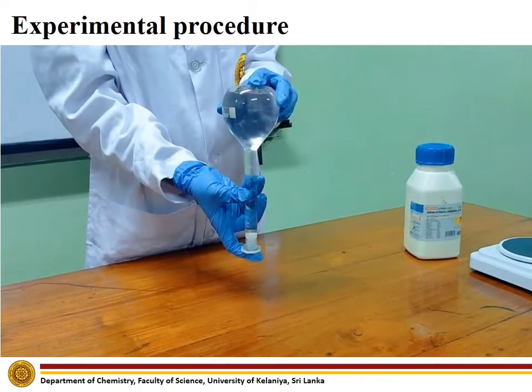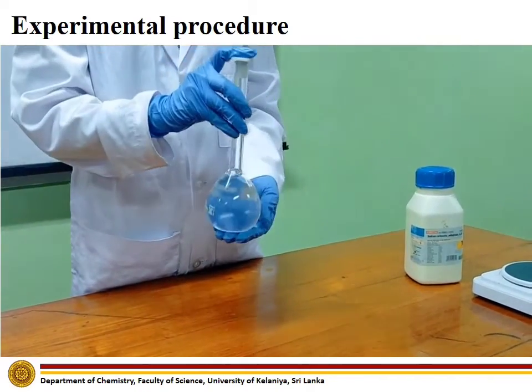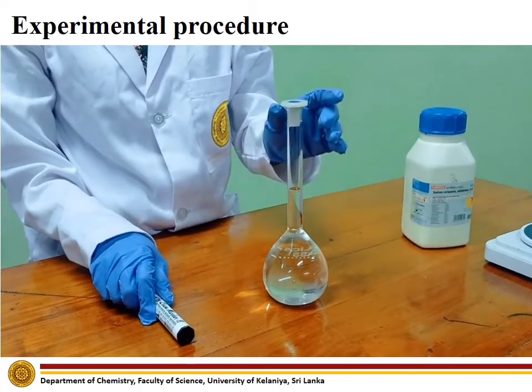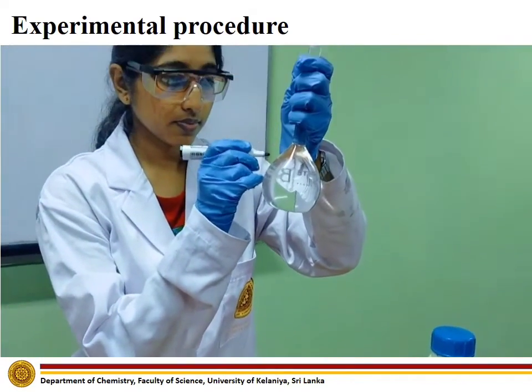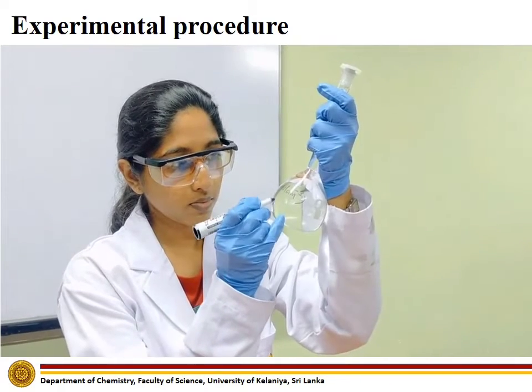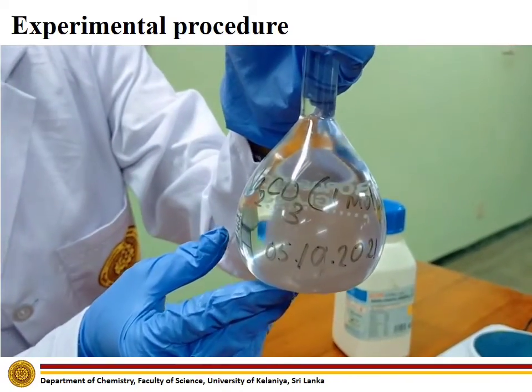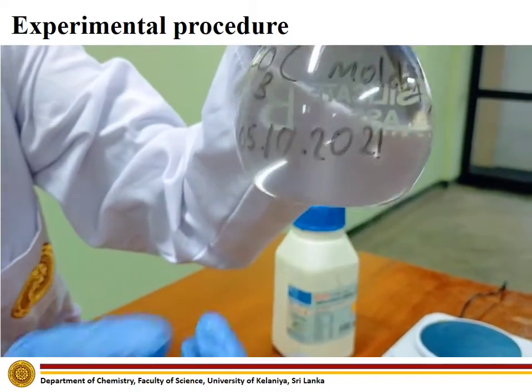Invert the volumetric flask to mix the solution well. We have now prepared the sodium carbonate standard solution. Label the solution after preparing it. When labeling the solution, mention the name of the solution, the concentration of the solution, and the date that the solution was prepared.